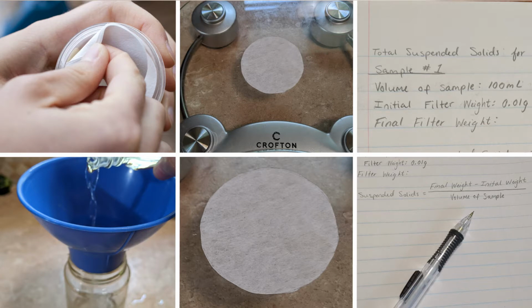Finally, after the filter paper is completely dry, we weigh it once more. The total suspended solid is the final paper weight minus the initial paper weight, divided by the total volume of water that we used. Typically, we measure this using milligrams when weighing the paper, and we convert our water amount into liters.